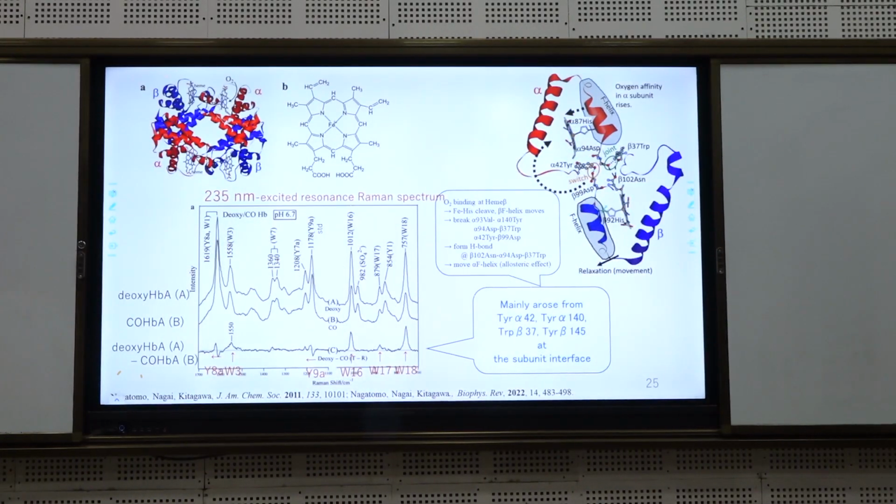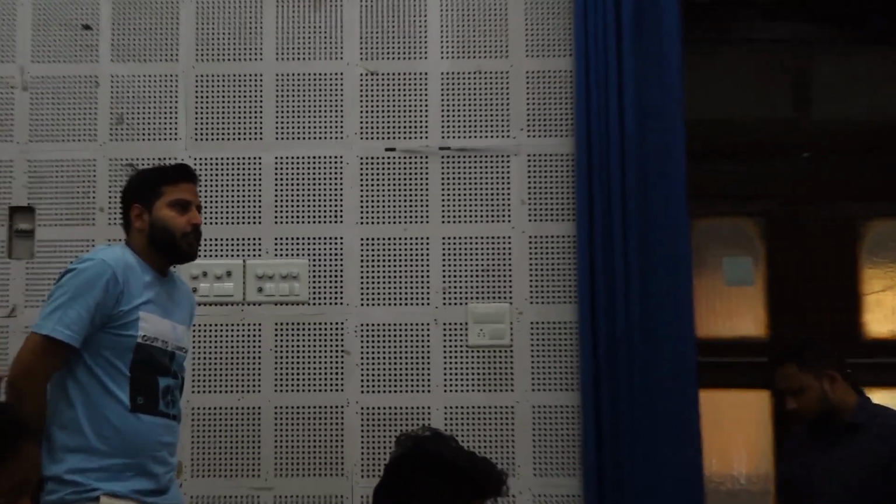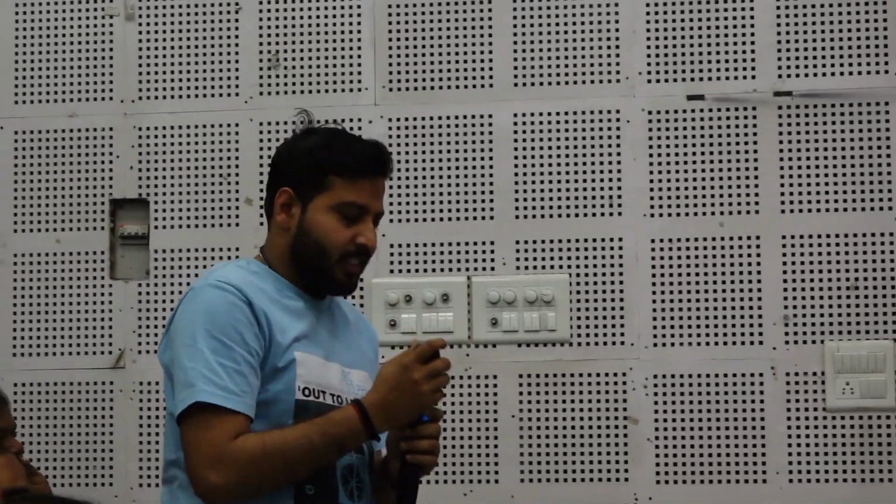Sir, I have one question. When you are deciding the excitation source for every biomolecule, you take the absorbance band as a reference, and then choose the excitation source for each biomolecule.